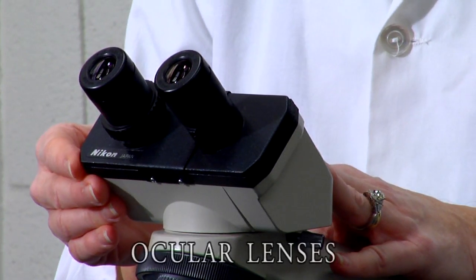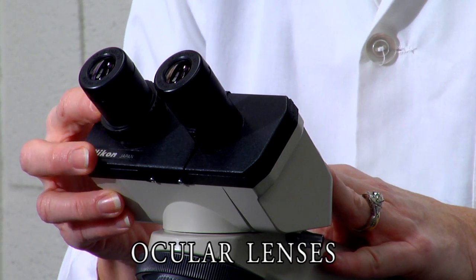You also have three sets of lenses. In the head, as I said, you have the ocular lens, which magnifies ten times.